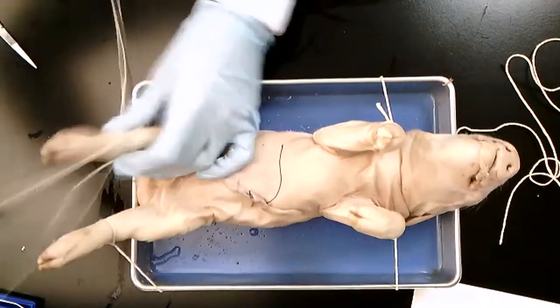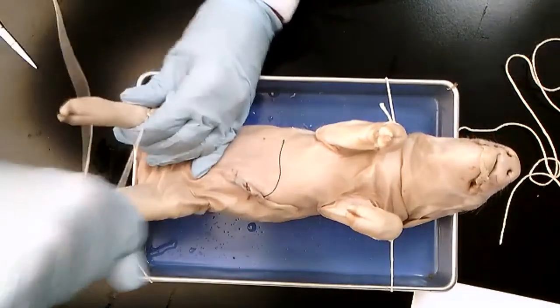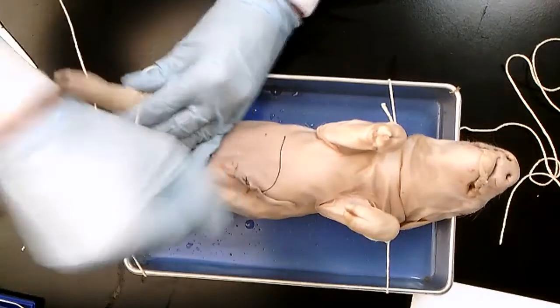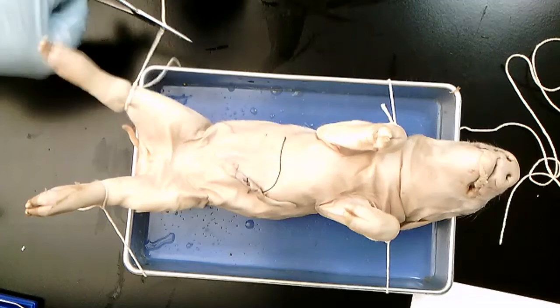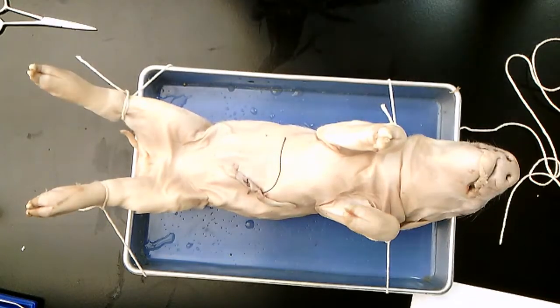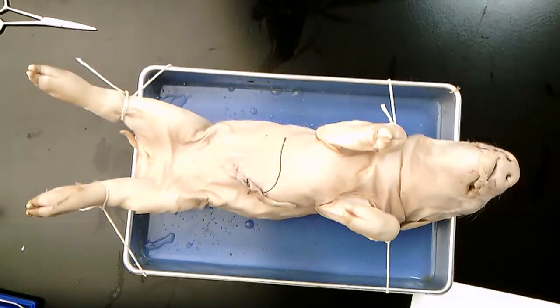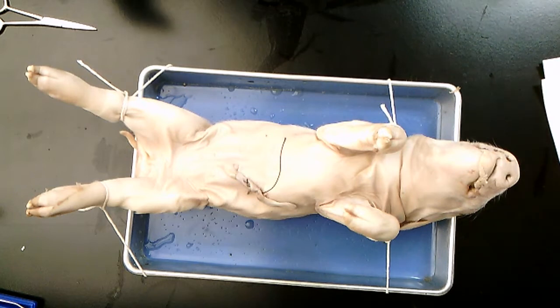Your students may be tempted, because there's 4 of them that'll be working on this, they may be tempted to want to hold the legs apart for the other students. One of the reasons why this is likely going to be safer is that way there's less hands in there when cuts are being made and incisions are being made. And so if there are fewer hands in there when those things are happening, the less likely you'll have an injury. Matt brings up a good point.